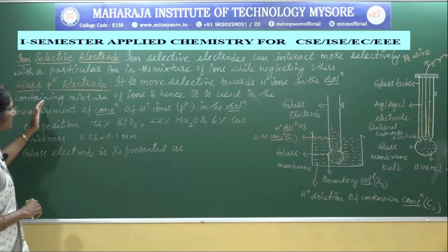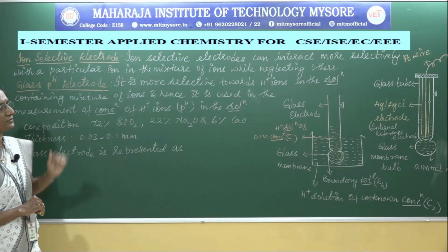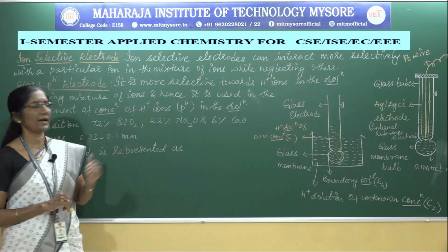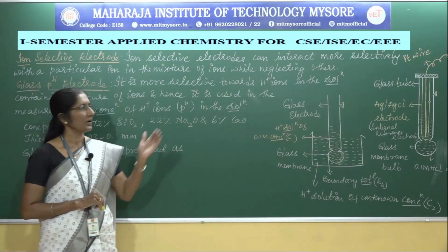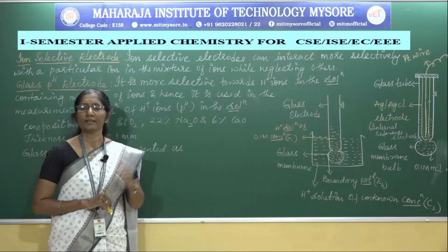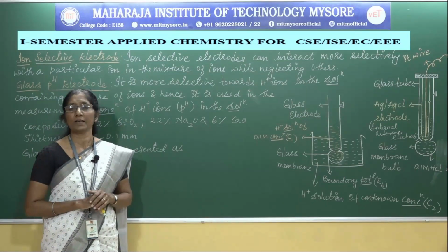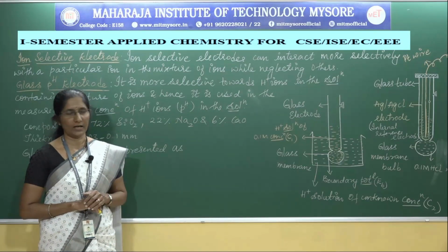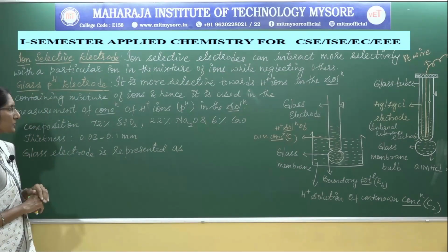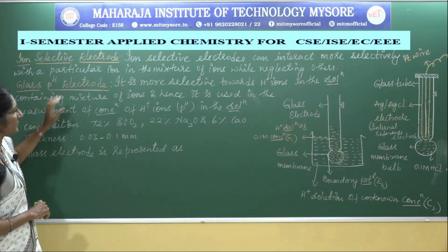These electrodes can accurately measure very dilute solutions, like 10 to the power minus 6 molar. They are highly selective and suitable for rapid, low cost and accurate analysis. That is why they are used in almost all fields, like agricultural, biological, chemical, clinical and industrial laboratories. The best example of an ion selective electrode is the glass pH electrode.